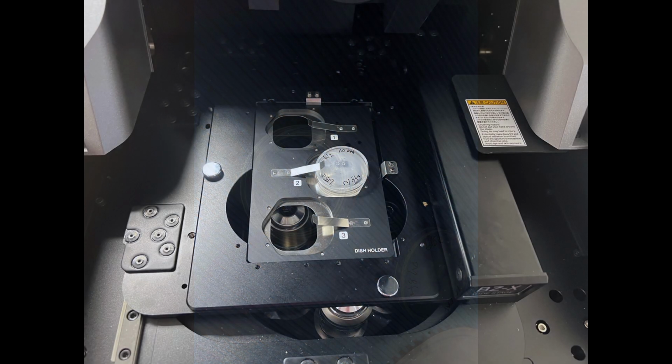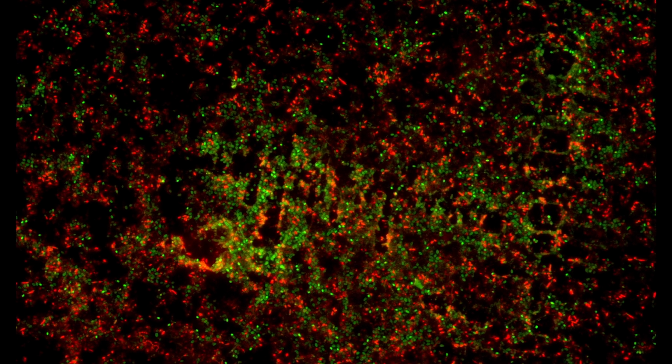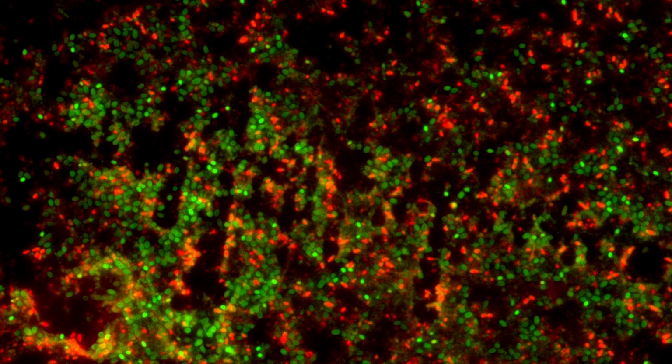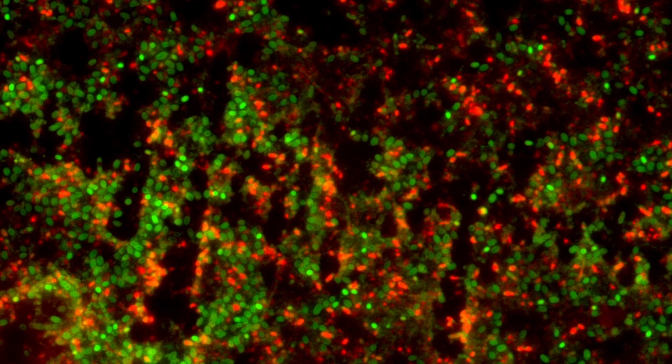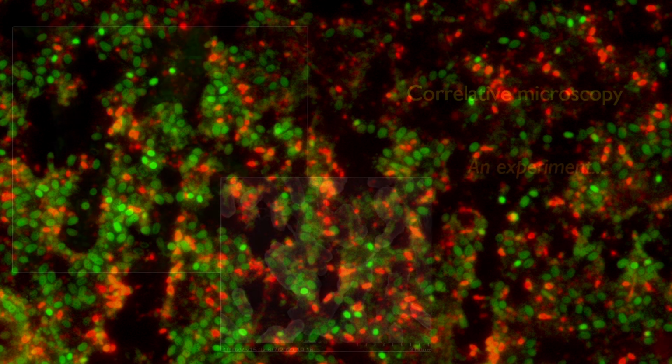And then I decided to put new sterile media on the dish and let it sit for a couple days, and then actually try a live dead, assuming that all the bacteria were dead, but knowing that it's almost impossible to desiccate bacteria to death. So then we did a confocal on it, and lo and behold, yes, there's a lot of dead bacteria, but there's some living bacteria that came from that culture with desiccated bacteria on it.